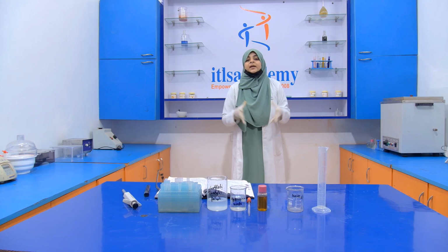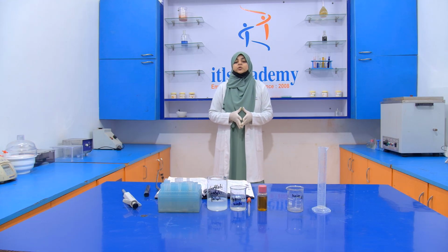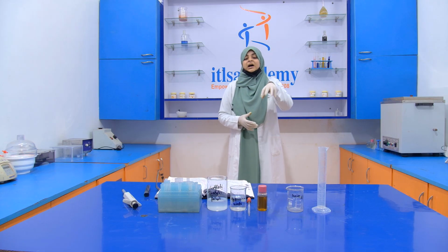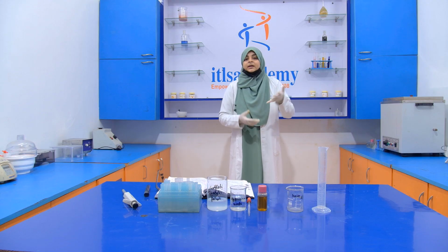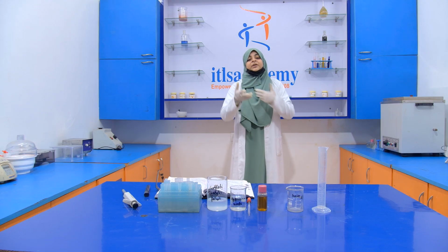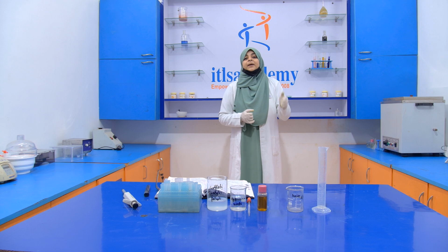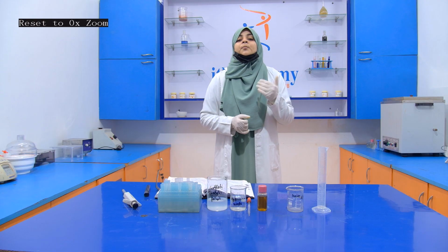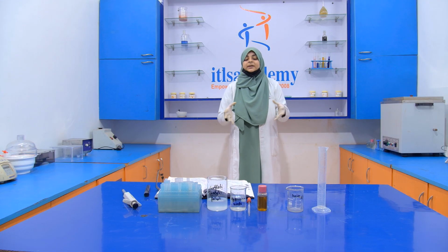So that's why it is very important to detect mineral oil in edible oil, because due to these harmful effects it comes under the category of adulterant. So this is the reason behind the detection of mineral oil.